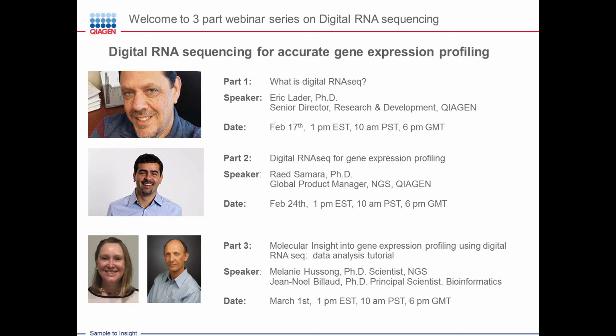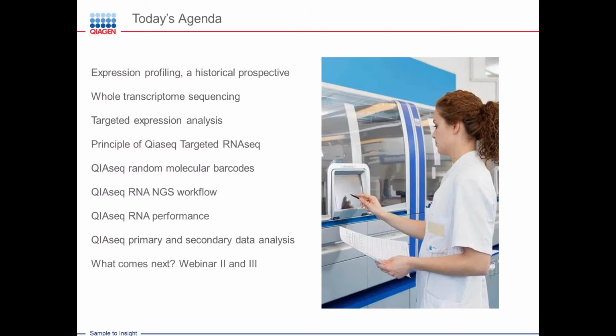So what I'd like to talk about today is a little bit of an introduction to expression profiling and give you the 1-minute historical perspective. I've been doing gene expression analysis, I'm happy and somewhat sad to say, since 1981, so for quite a long time. Talk a little bit about whole transcriptome sequencing and then why we started to think about doing targeted expression analysis, and then do a much deeper dive into the QIAseq targeted RNA-seq technology.